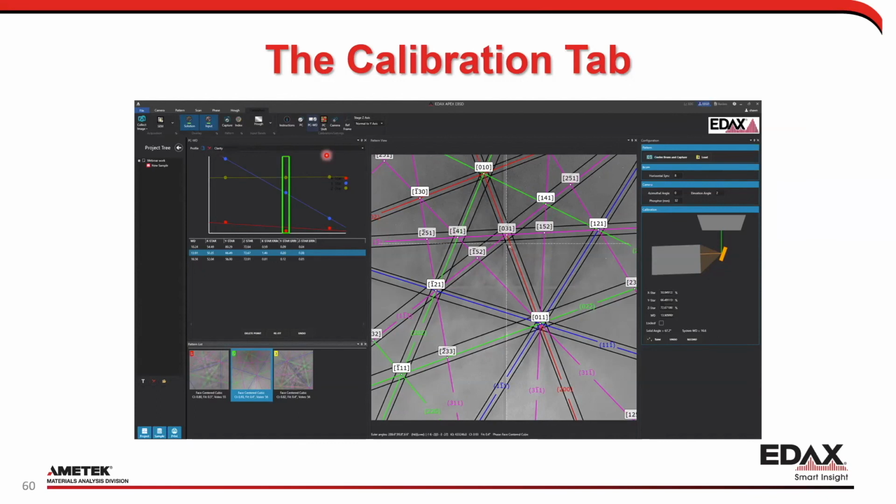What would be the other reasons I would want to save calibration profiles? Well, you can see my detector in this case is usually all the way in. Some stages will have attachments to them, like either a tensile stage or a heating stage. What that means is I usually can't put my detector all the way in; it has to be slightly out. So in that case I put my slide in to a certain distance, and then I can change to a different calibration profile instead of making a new one. I just make it once, and I can change back and forth.